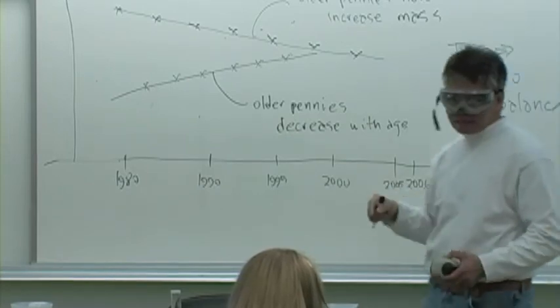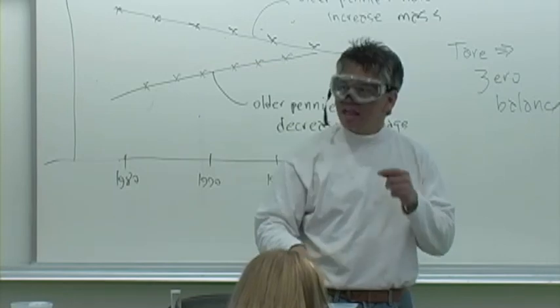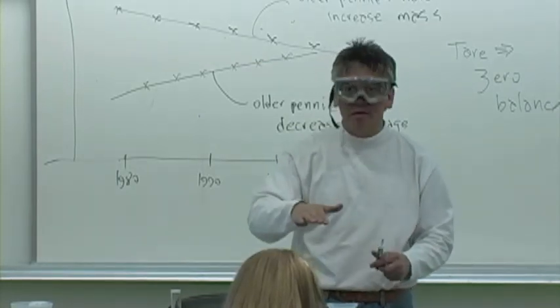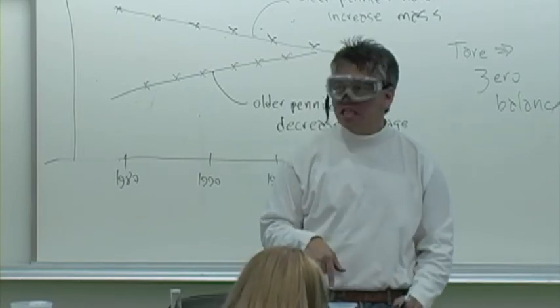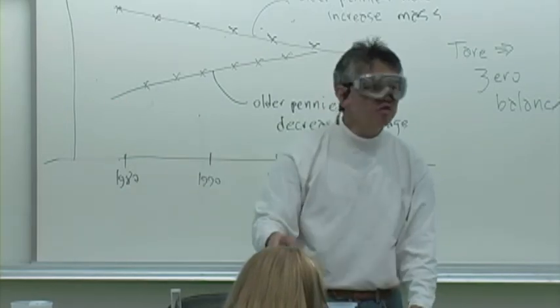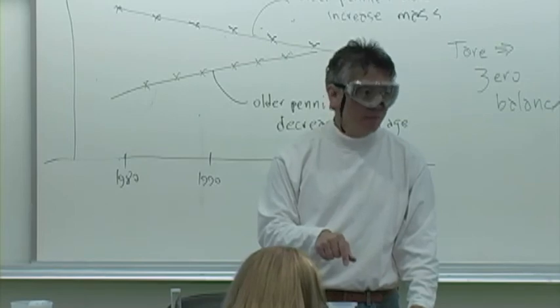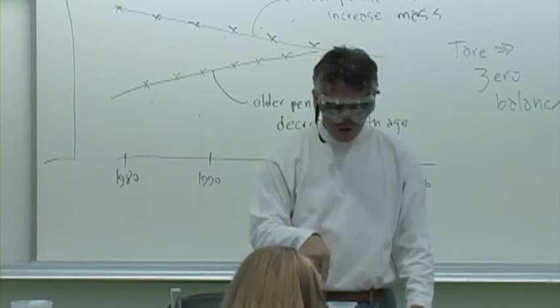What does that mean? It means that the reading now on the balance is 0.00 grams. Not that the weighing boat is 0 grams, but now you have a reference point. It's got 0 grams in it, and the balance is pretty sensitive. If you talk over it, or if you run your hands through it, it's going to fluctuate, because this thing measures to the closest milligram. And so any wind current or air drift is going to reflect on the mass.